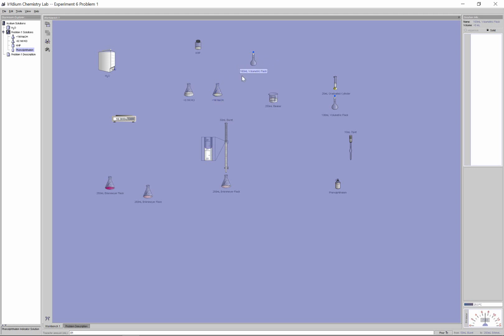You have two choices at this point here. You can use a burette, because a burette here is so fine-tuned. You can use this and dispense exactly the volume that you want. Say I want to dilute 8 milliliters or 9 milliliters. I can get it from here. That's going to be somewhat more precise. The other way you can do it here, maybe a little bit easier, is using a grad cylinder.